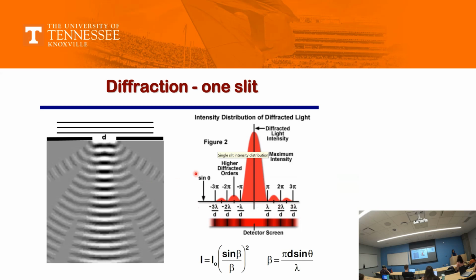And this is very good, because in our case, this is what we get. We get a clear bright spot and a black screen next to it. Then spots. So you have this kind of diffraction happening, where the intensity of the minima has to be 0, because if it is still there, then you get confused whether it's a minima or your weak beam spot, right? So this is one thing.